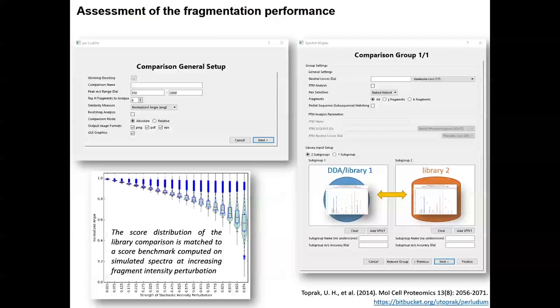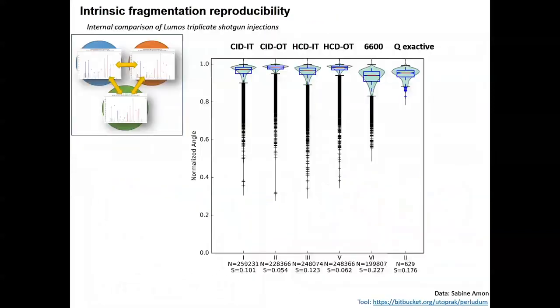So we also convert the dot product score into a real percentage of variance for the similarity of the spectra. This is the type of thing that you hope to have: plus or minus 5% for each of these fragments would be acceptable. But if you start to get something like plus or minus 30 or 50% for each fragment, then the fragments start to pass on top of each other, and you might get trouble if you want to transfer fragmentation patterns from one machine to the other machine.